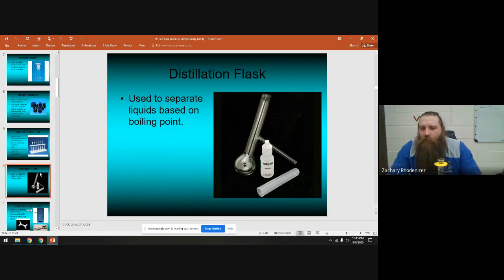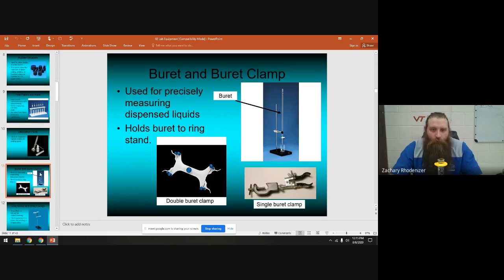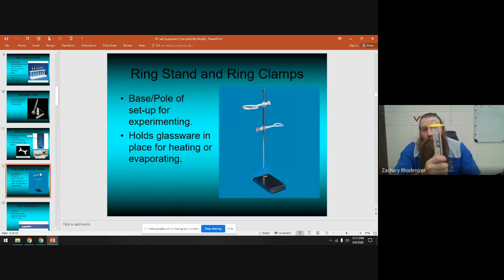A distillation flask is not something we'll use this year, but it's used to separate liquids based on their boiling points — that's what it means to distill something. We do use burettes — that really big tall piece of glassware — along with the buret clamp, which comes in single and double versions. Burettes are also good for measuring out a very accurate specific volume, like exactly five milliliters.